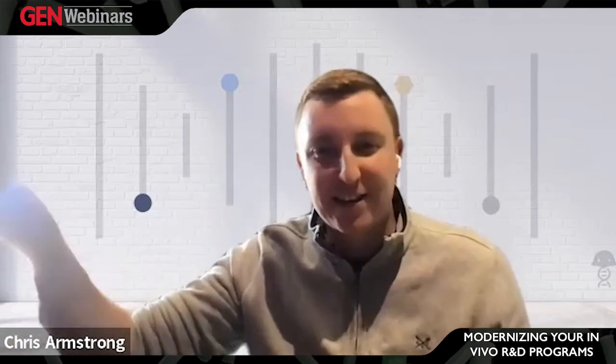Yeah, and I think you've raised a good point there that would maybe alleviate a fear associated with that, because I certainly know that if I had a study and I was working and all of a sudden data started changing and somebody else had access to it, that would be a bit of a concern. The way that we get around that is we do have study-specific permissions. So in every single study, you can assign the people that you want to have access to that study and who should be able to influence it. So as Catherine's pointed out, you could say that I want to give myself write access, one of my colleagues write access, and maybe, like as you pointed out, it might be your boss who's sitting in the office and never actually comes into the lab and they just want to glance at the data. Just give them read access. It means that they're never able to change data points anyway.